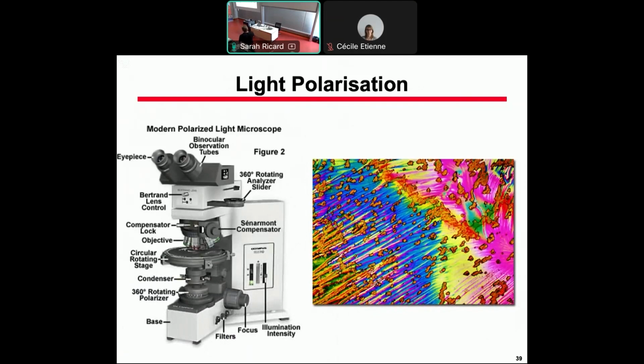And this is the kind of image. As I told you, it's made in white light, and because the change of the light fields varies with the wavelength, you again create these nice interference colors. Often it means a microscopic image.